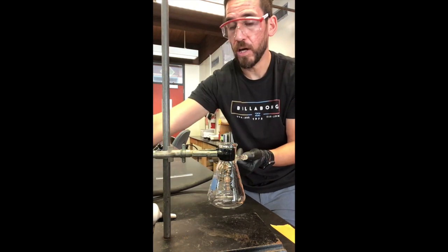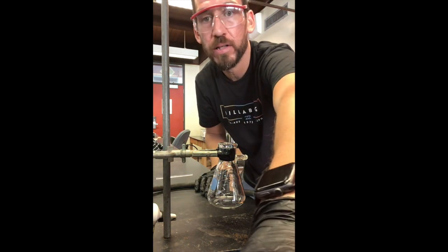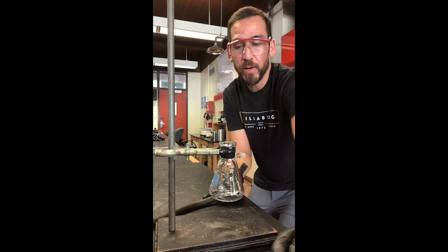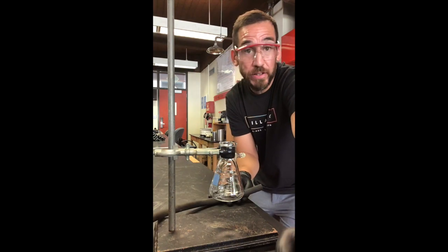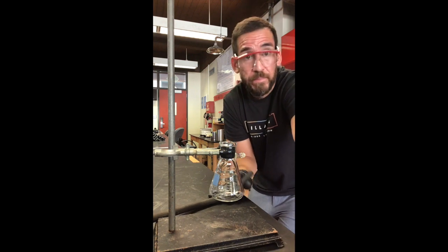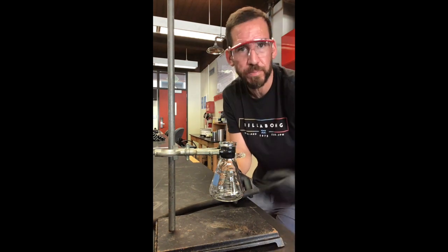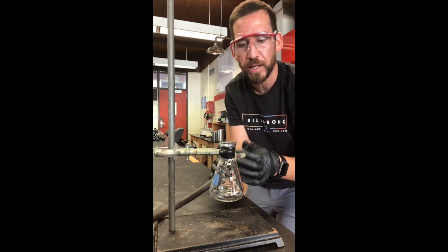Okay, hopefully. Oh no, this doesn't work. Oh no. Pause. Okay, so that's a common thing. There's a couple of vacuums in this organic chemistry lab that don't work. And so, hey, I just showed you a realistic scenario, right? So move on to the next spot, either in a hood or an adjacent spot.